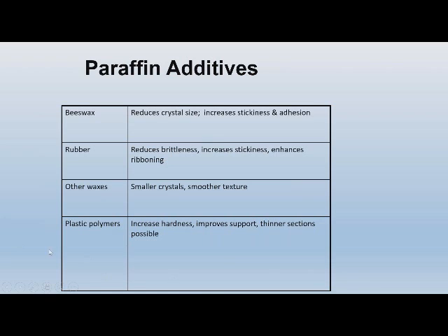Plastic polymers, like I said, are really the additive for most paraffins, because they increase hardness, improve support, and you can get thinner sections. So these plastic polymer versions of paraffin would be the ones more likely to have the high melting temperature.